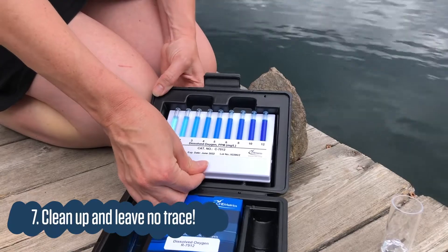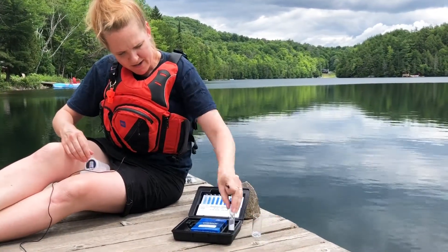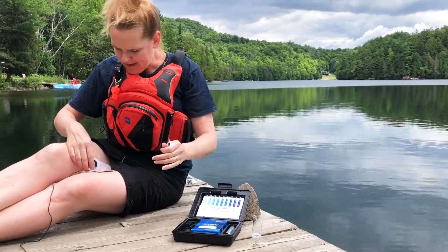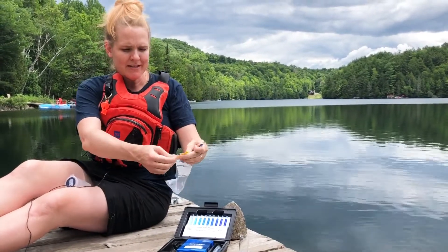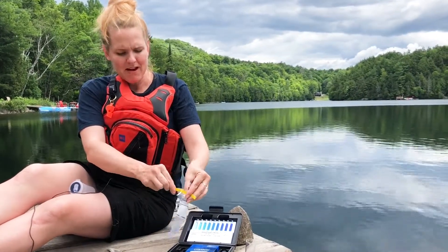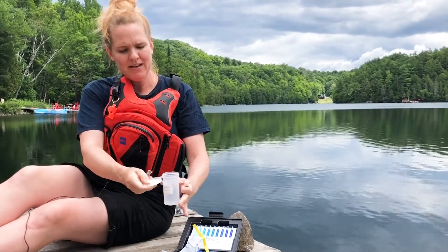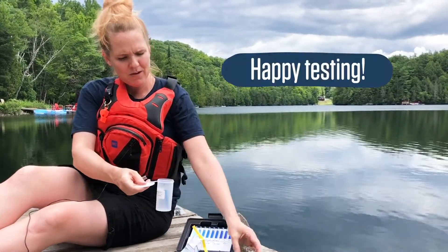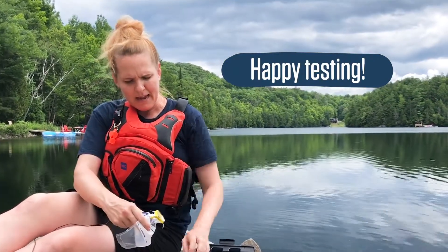Now it's time to pack up. We're going to put our chart in first, under the nub, and press down. We still have our little container to dispose of. In older kits we include whirlpack bags — open it up, put your ampoule in there along with the little tip. In our newer kits we include a little container where you can put your ampoule and shake in the little tip. Then we're done and you can pack up.